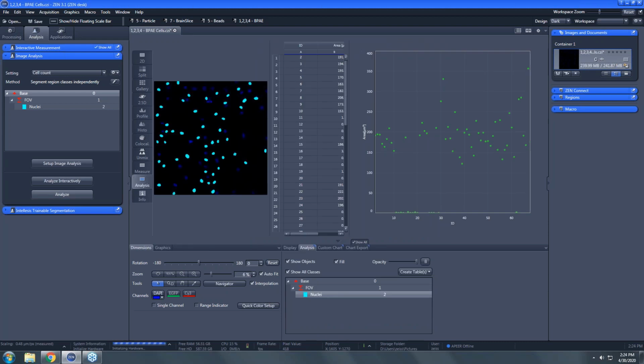Terrific. So it looks like we had to expand our filter a little bit because we missed some of the nuclei there. But this is usually an iterative process where we go through and we see what we get, and then we kind of go back in and say, okay, we got to tweak this or that. Helping with that is the data that we have on the right now, because we can see the plot and we can see if we have any outliers.